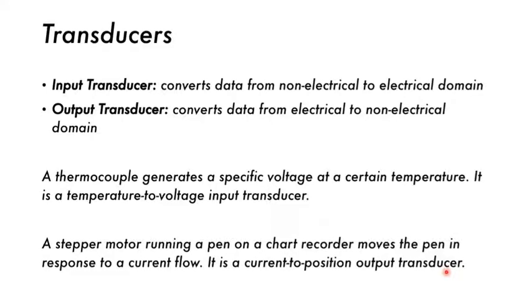Yes. So the stepper motor, is that how the lie detector works? Yeah, right. That's a good analogy. It's an actual pen, yeah. It actually moves up and down on the piece of paper. Like the old school lie detector. That's a good one. I forgot about it. But that's basically how it works. So you can imagine if there's a signal which is too high, the pen goes off the page and can actually break the stepper motor.